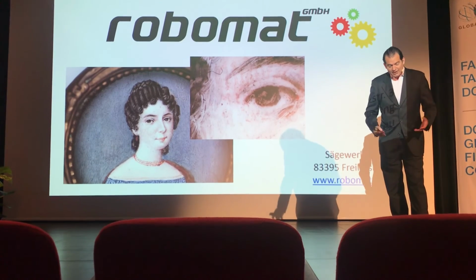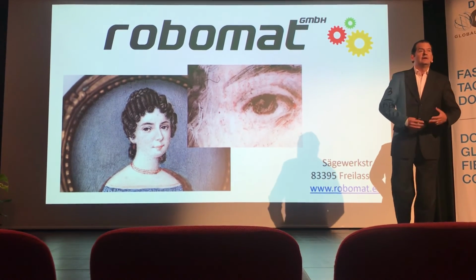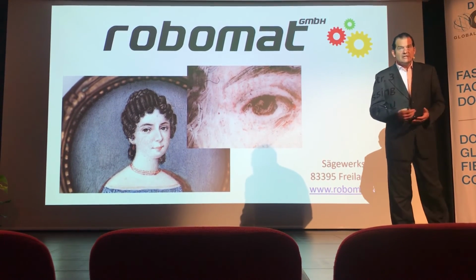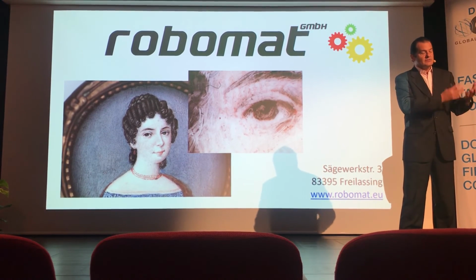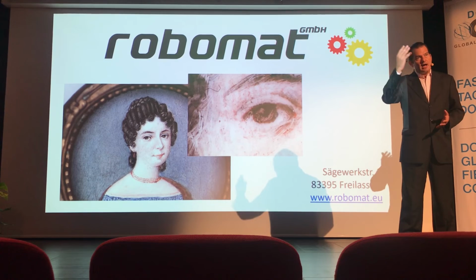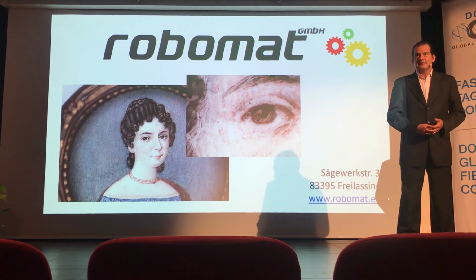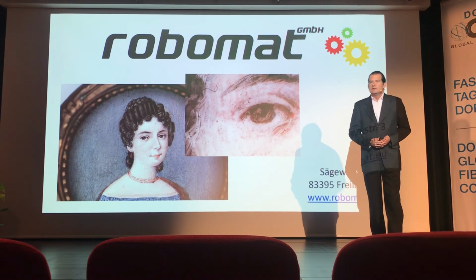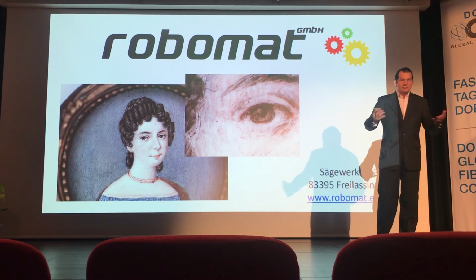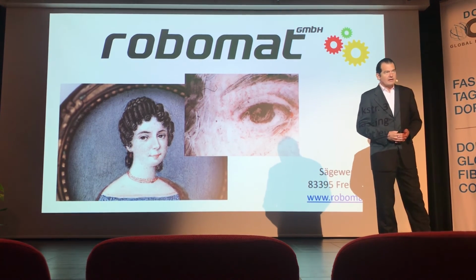So to conclude, I would like you to remember that the Roboscope is a flexible machine. We have 3 models. We've got the Micron, which is the high resolution. Up on our booth, please come and have a look at the lab version, which can go down to 20 microns per pixel. And then we've got the SC, for example, for the nonwoven applications that we've done.